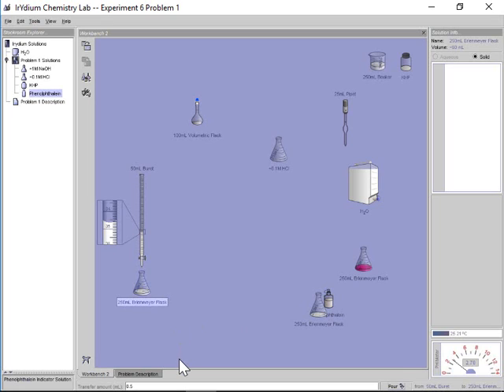So maybe I'm going to drop it in at 0.05. Right? And I'm getting really close here. So keep dropping it in. I'm looking for that instant when it first changes color. Right? So the first one gave me a nice ballpark here. Let's see how long this is going to take. Oh, there you go. Again, whoops, I overshot by 1. But again, that's another reading. Let's just take down that reading there.